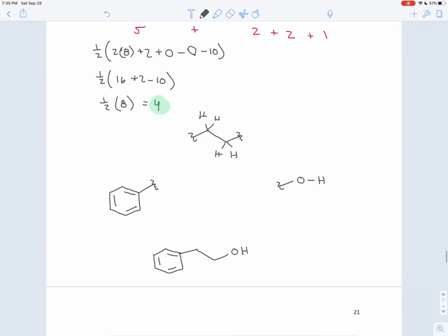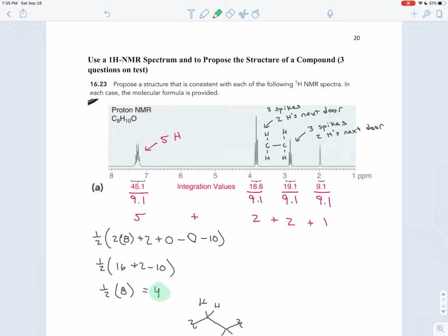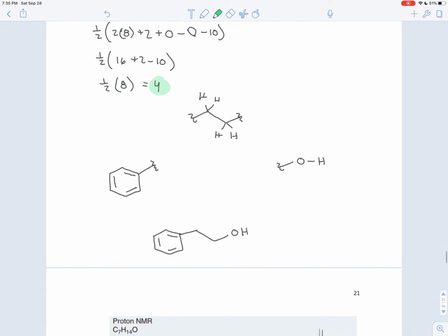So that would be our molecule. The average person would look at this chicken scratch, these Egyptian hieroglyphics, and it would mean nothing, but you can look at it and see this molecule here.